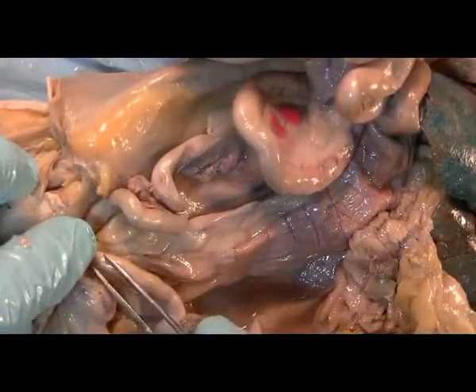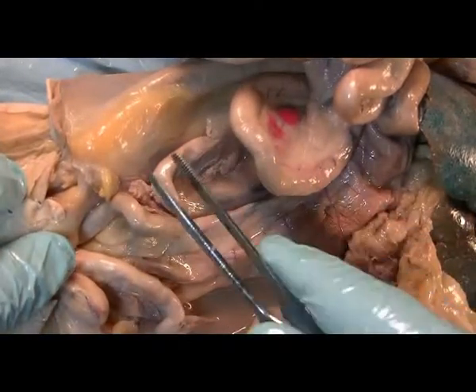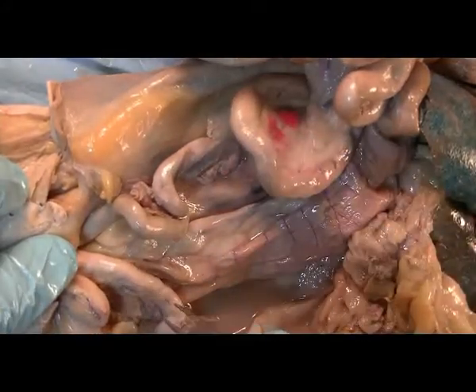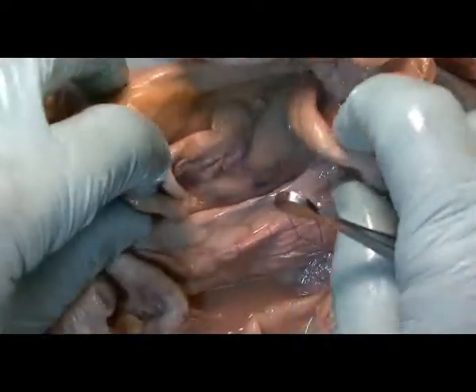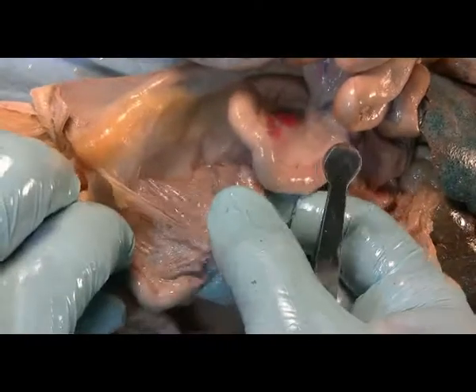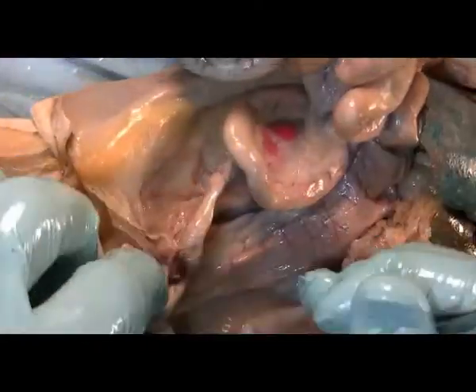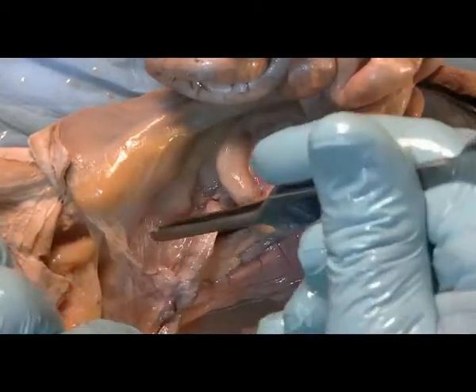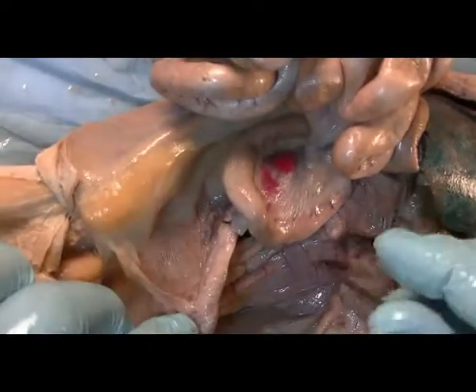Here is the V-shaped uterine horn. In cats, the babies are in the horn, which allows them to have multiple births. And the membrane that anchors it to the dorsal wall is called the broad ligament. I'll hold one of the horns out. This is called the broad ligament here and here. And then there's a perpendicular part of it here.